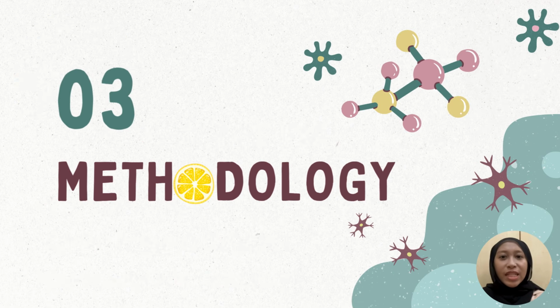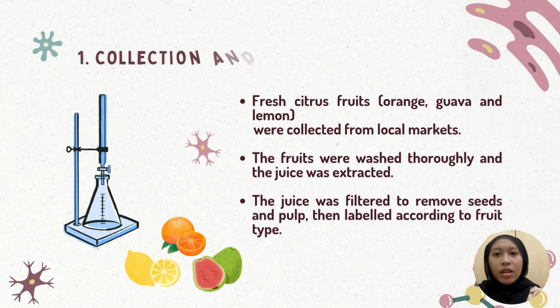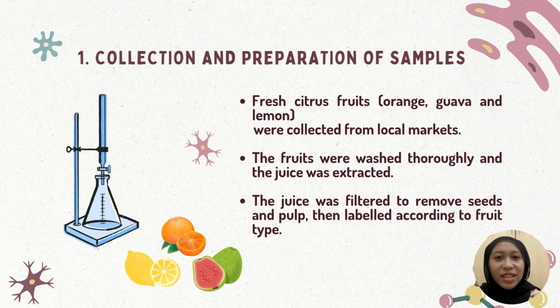Hi, now I will explain the methodology used in this experiment to determine the vitamin C contained in orange, guava and lemon using titration. So, the first one is collection and preparation of sample.